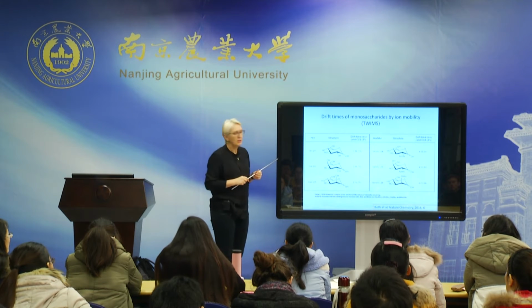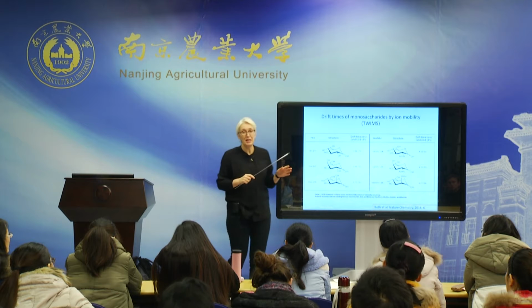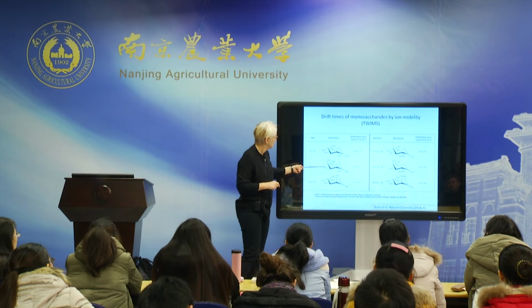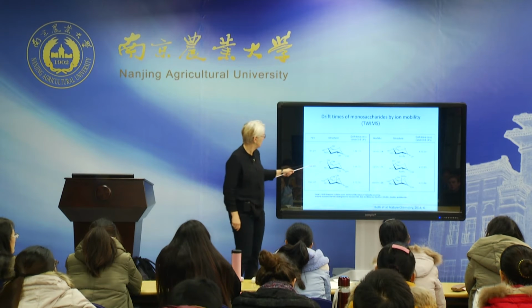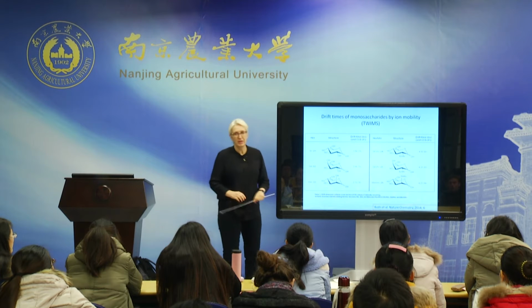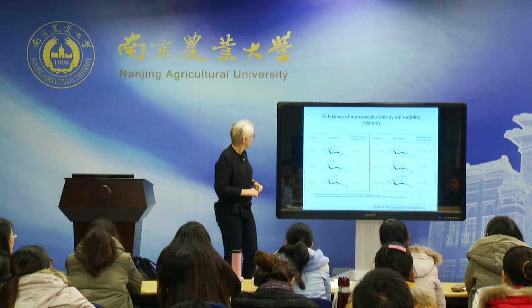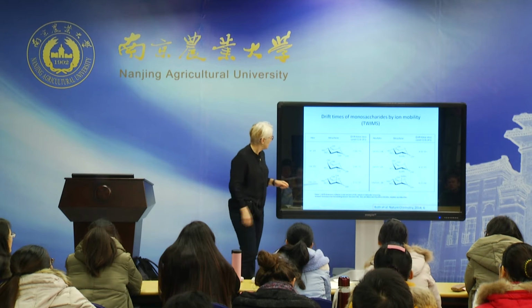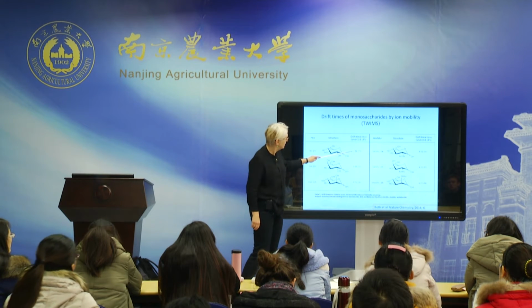So the question is, what about carbohydrates? The shape here, as you can imagine, doesn't actually change very much if you go from glucose to galactose, for example. As I said before, this changes a hydroxyl group around. You can think, maybe it changes a little bit. And we were just wondering whether it was sensitive enough to actually see a difference. And you can see, actually, we can indeed see a difference.